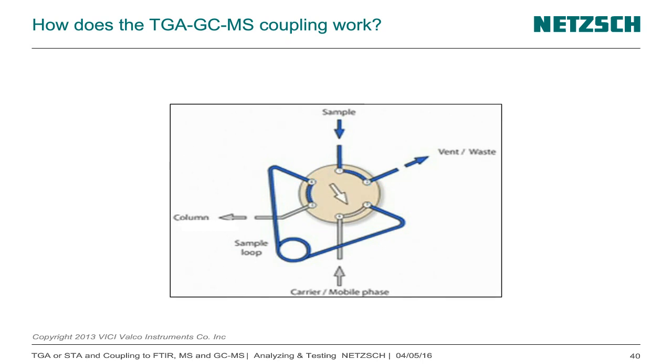And if you now give the order that the valve should move, then you see the carrier gas from the GC is going and takes out the content of the loop and puts it onto the column. So this is an easy, nice thing which works perfectly with switching around, and you can fill and add whenever you want.